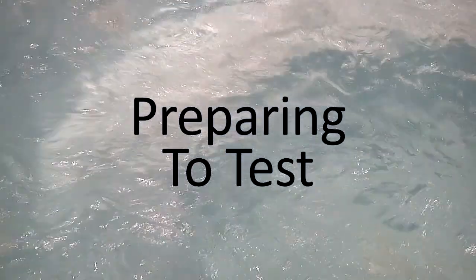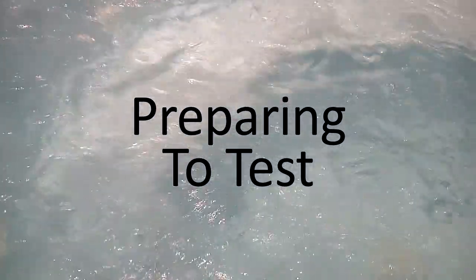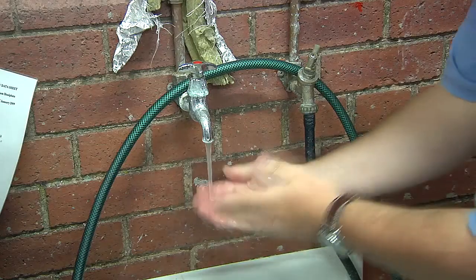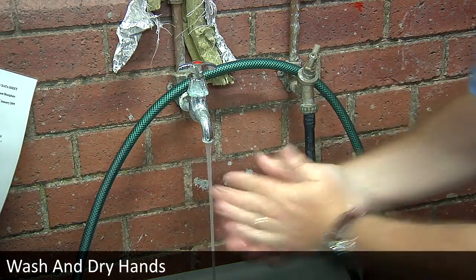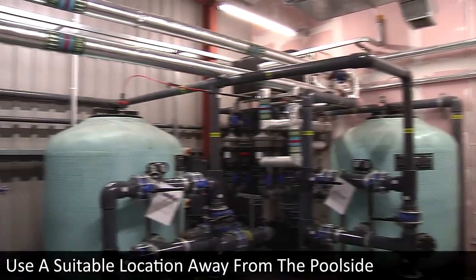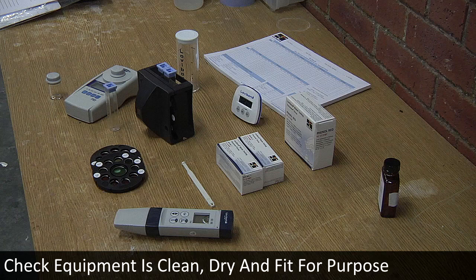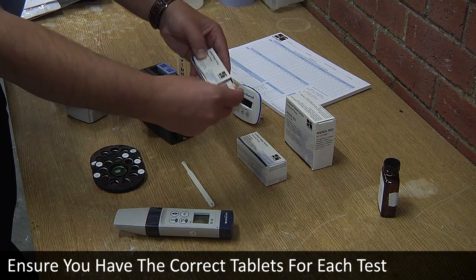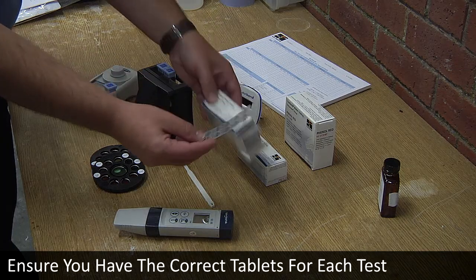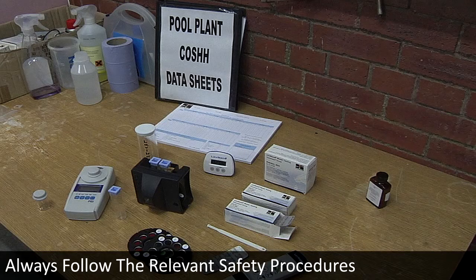To ensure accurate results, we recommend the following steps prior to testing: wash and dry hands, use a suitable location away from the poolside, check the equipment is clean, dry, and fit for purpose, ensure you have the correct tablets for each test, and always follow the relevant safety procedures.